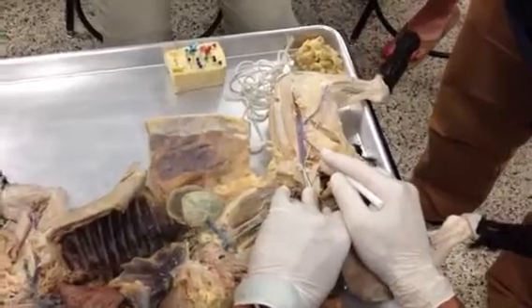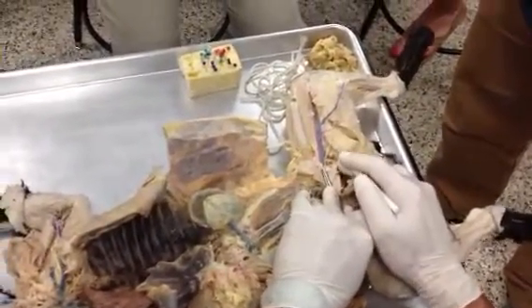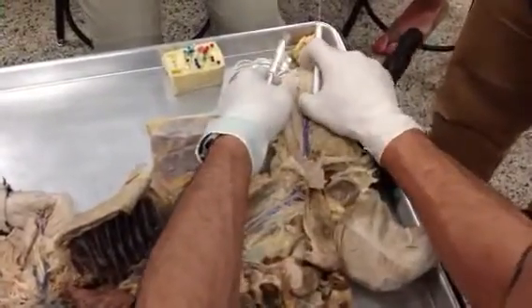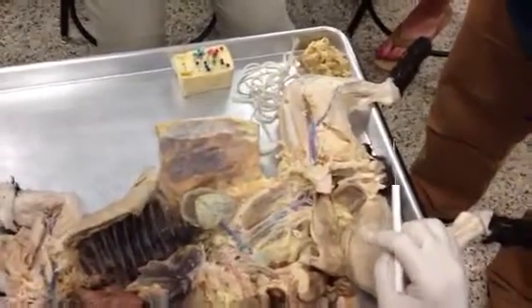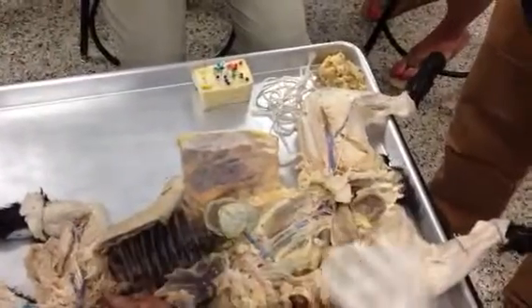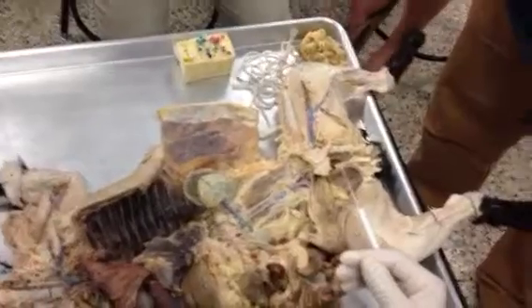There is my caudofemoralis artery next to the caudofemoralis vein. And then my femoral artery just runs whoop to behind the knee. And behind the knee, it is called the popliteal artery. So again, folks, location, location, location. You know these body regions already. You should from Bio 141. The names take on the same. Right, so those are the blood vessels.